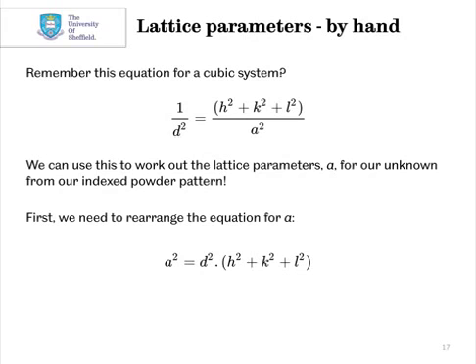So we've now got our peak positions, and we've got our Miller indices for this mysterious metal. We looked at this equation earlier on briefly: 1 over d squared equals h squared plus k squared plus l squared over a squared. We can use this equation to manually calculate the lattice parameter a for our unknown powder pattern. First of all, we need to rearrange the equation for a, so it becomes a squared equals d squared times (h squared plus k squared plus l squared).